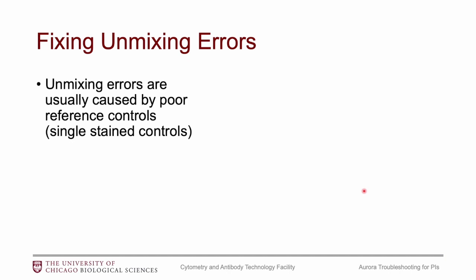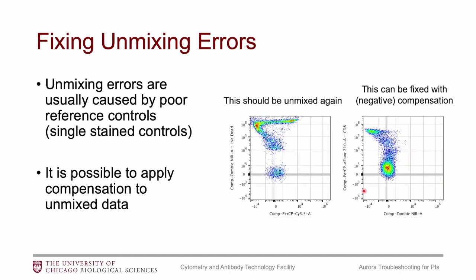To fix unmixing errors long-term, as mentioned, better reference controls lead to better unmixing. If you keep running into problems, think about how the reference controls are being created. If there are only slight unmixing errors, it is possible to apply compensation to the unmixed data to fix it. You check unmixing the same way you check compensation — look at single stains, all n-by-n plot combinations, and hope to draw a straight line between the negative and positive populations. If a plot looks slightly overcompensated — or in spectral terms, slightly overcorrected — applying negative compensation to align the positive population with the negative is perfectly acceptable.